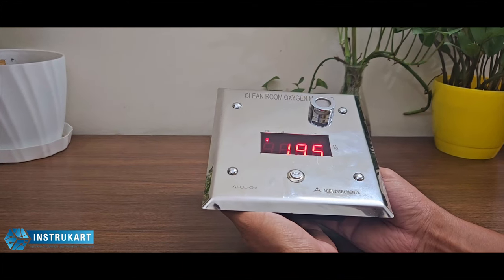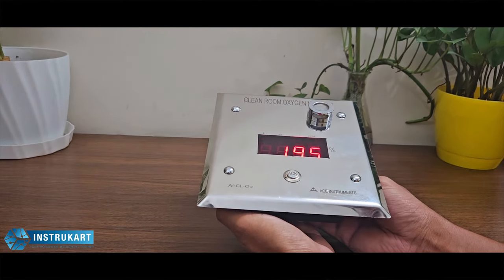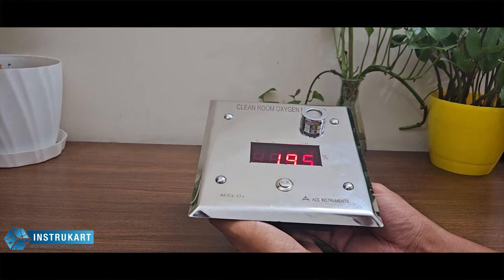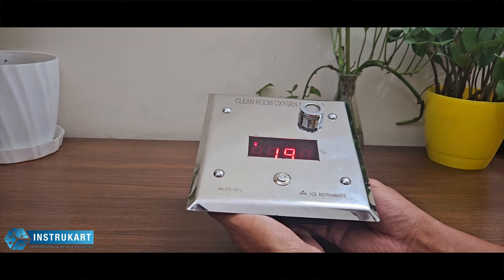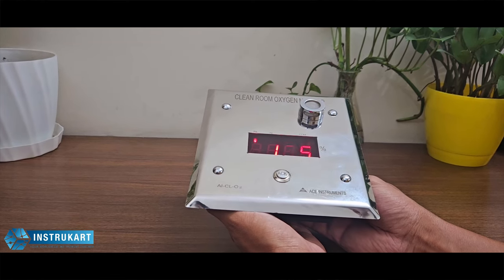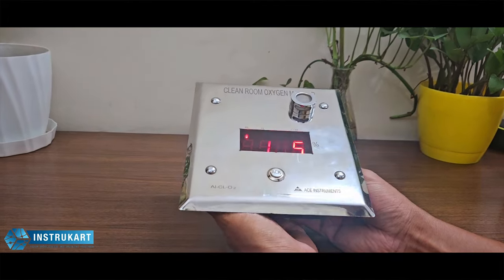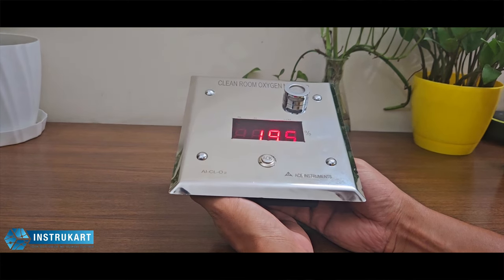Hello and welcome to InstruCart, your worldwide instrument partner. We have got a clean room oxygen monitor which detects, measures, and transmits oxygen in places like clean rooms, pharmaceutical drugs, and places where oxygen is a mandatory and very sensitive parameter for testing and measurement. This clean room oxygen monitor can measure up to 25% volume.